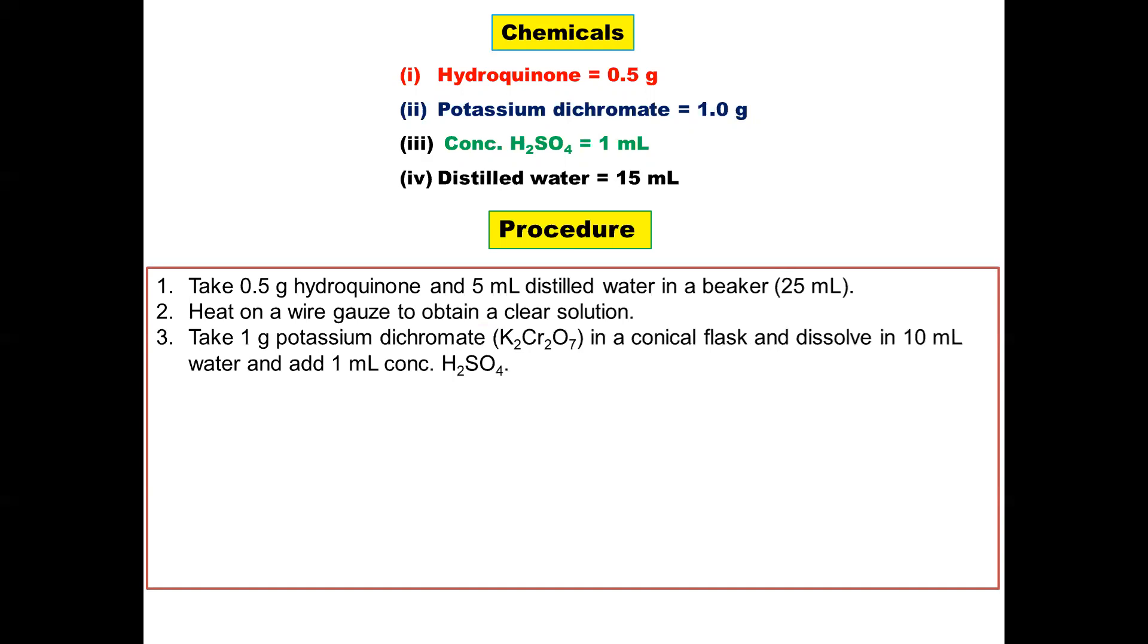Take 1g potassium dichromate, that is K2Cr2O7, in a conical flask and dissolve in 10ml water and add 1ml concentrated H2SO4. Shake and cool the conical flask in ice water.